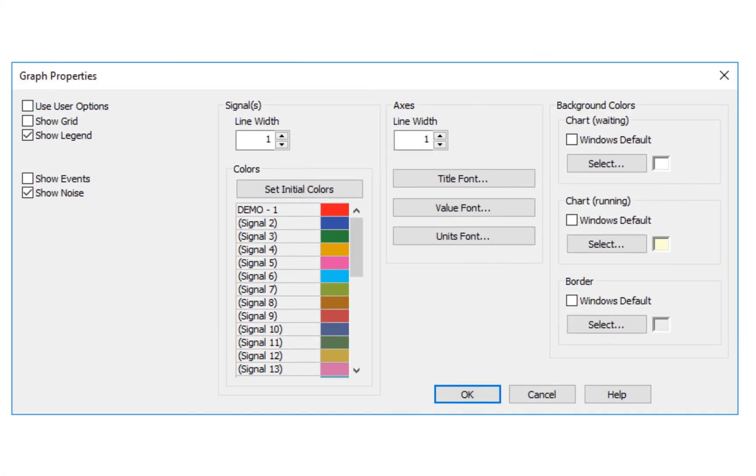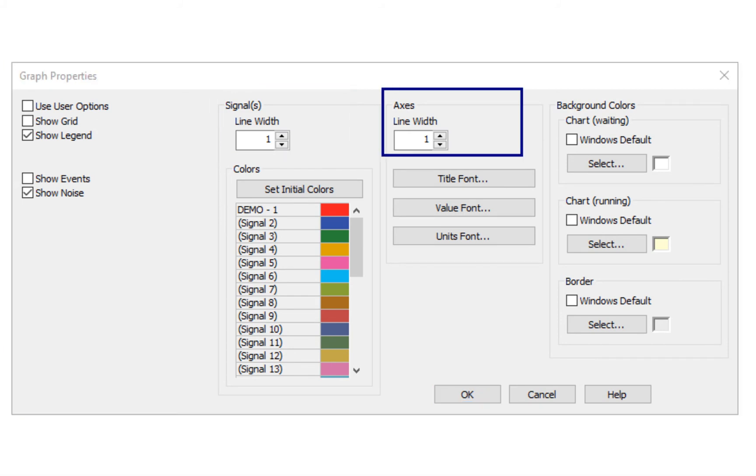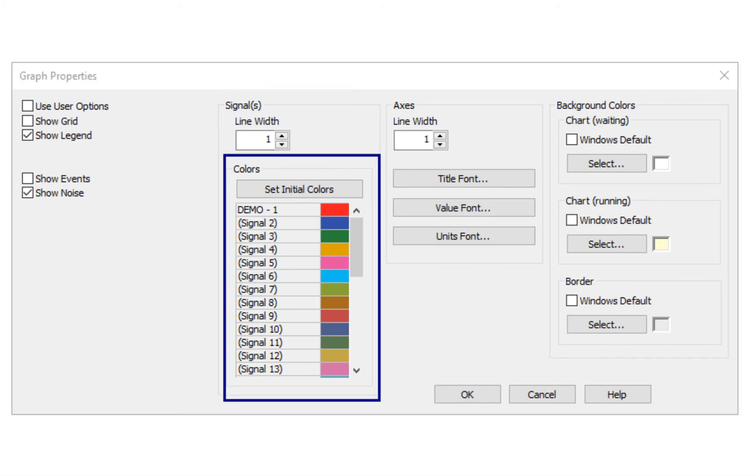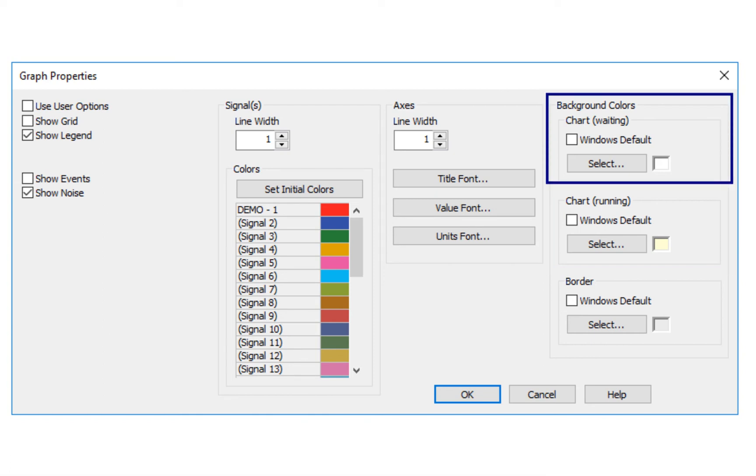Here, you can set other settings such as grid for easier reading of values, legend for purpose of multi-signal data acquisition, set width of the signal line and axis. Choose custom colors of signals and change background colors for when the instrument is in running state or waiting state.